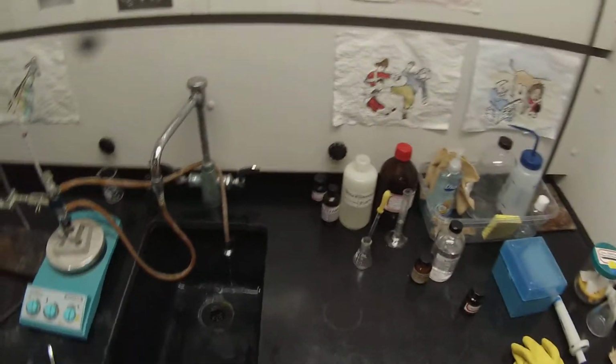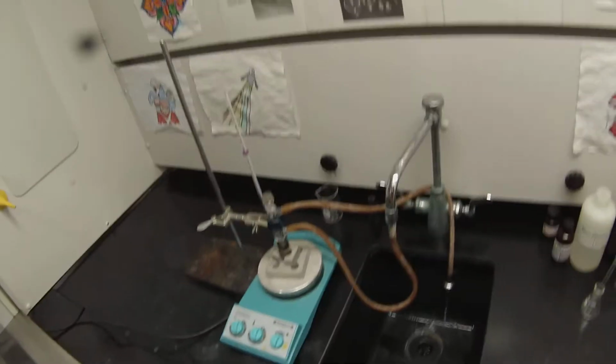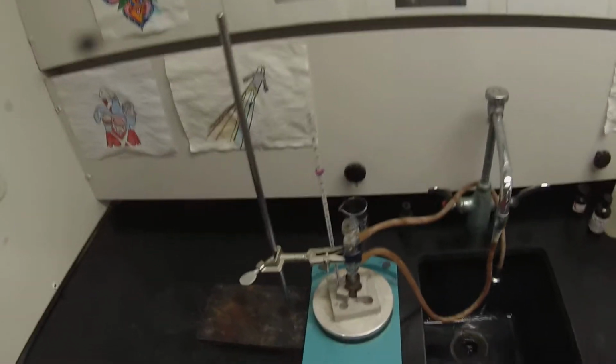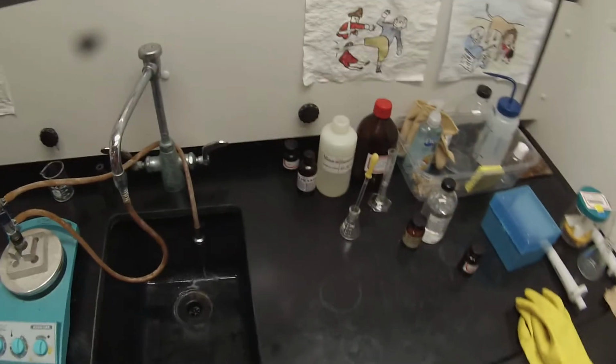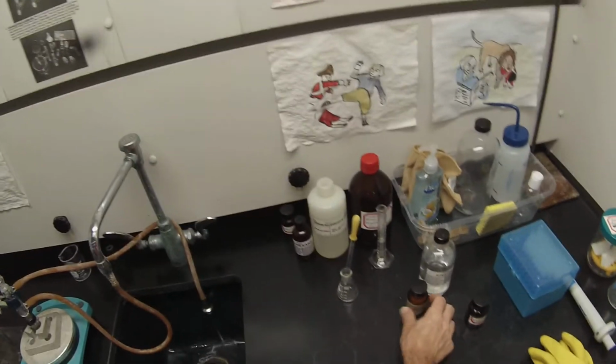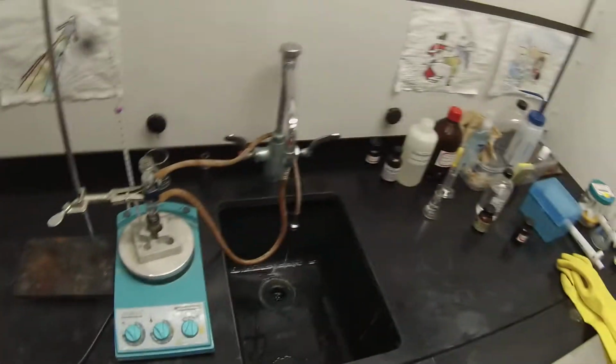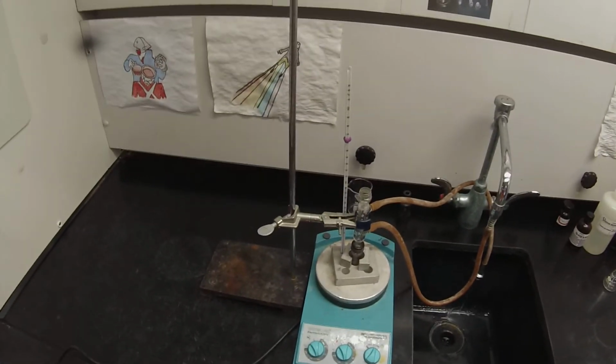Takes a little while to get that up to temperature. I'm going to make the t-butyl alcohol a separate video so you can watch it independently. But normally, while I'm waiting for these things, I would be measuring out my 0.2 grams of sodium carbonate and getting things set up for the next reaction. Since this has to reflux for 90 minutes, that'll be plenty of time to set up and complete the reactions of the t-butyl alcohol while we're waiting for it.